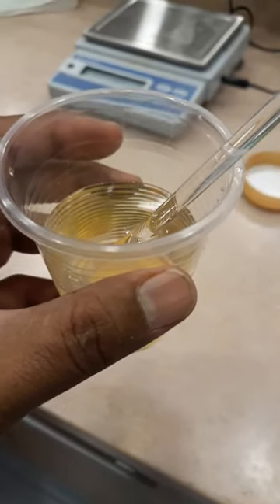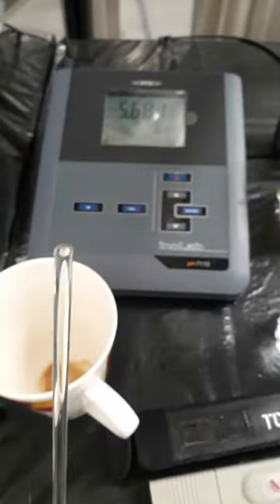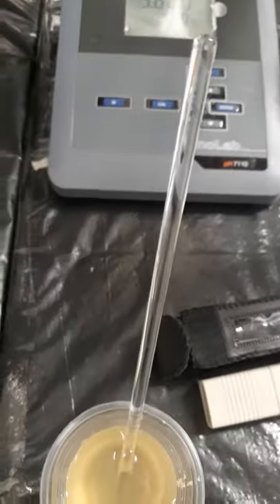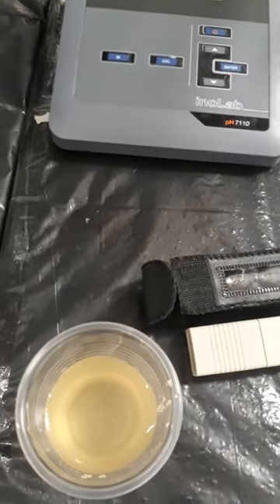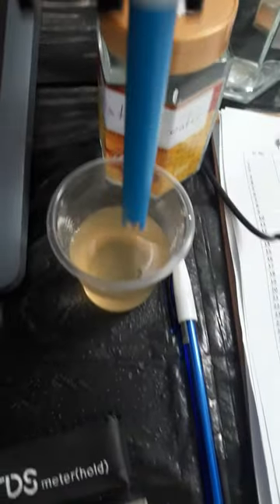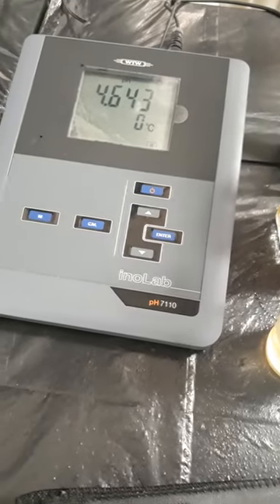I have the pH meter ready here, so I will check the pH now. I will wait for the stabilized reading.